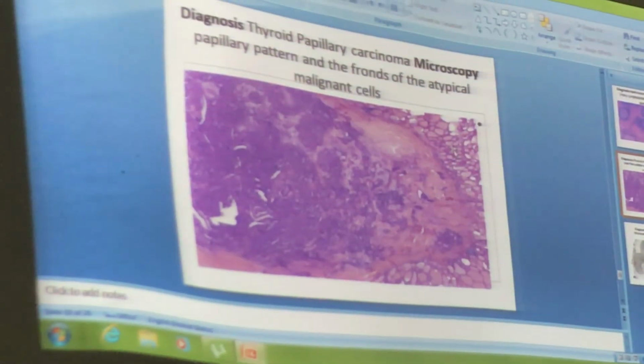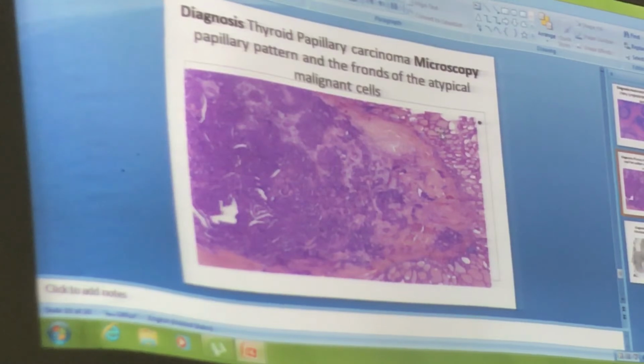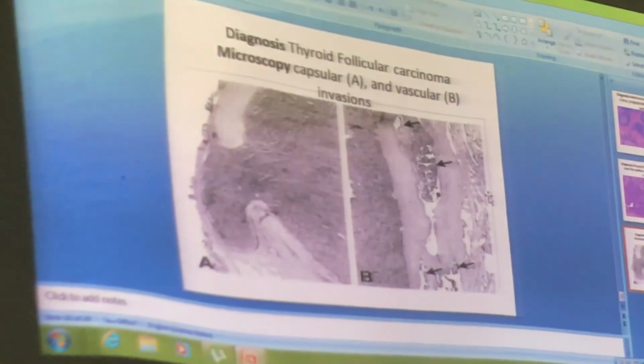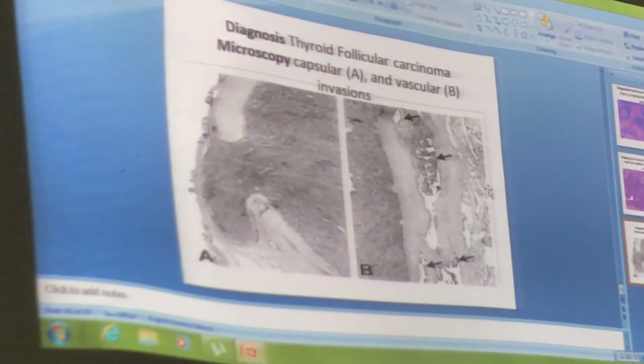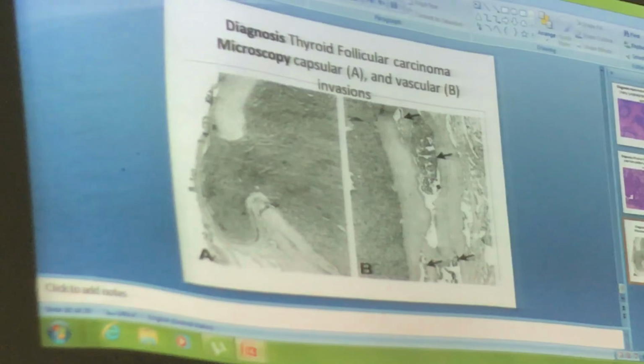What you see from this are colloids. These are small, the ones you see, the enlarged one, this is the small one, this is colloid from here. Colloid and the flattened epithelial cells. No. These are all the slides that are there for your practical. Okay.